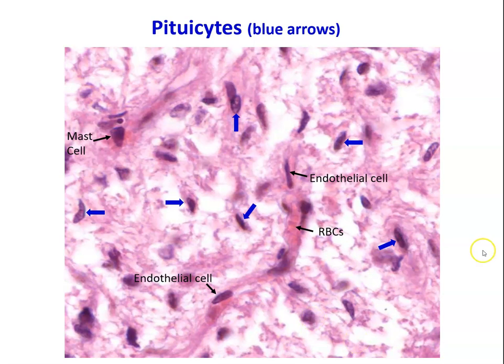There are also various other cells near the vasculature. In this case, I believe this is a mast cell, which you can see near the vasculature because that is where they enter and exit. Occasionally, you might even see a macrophage in this area.